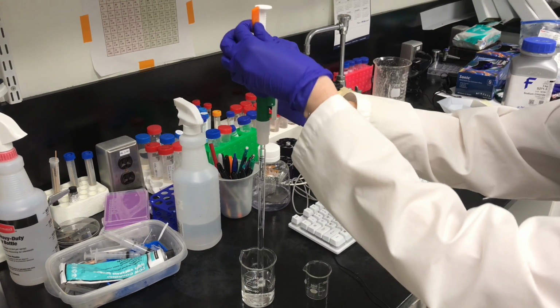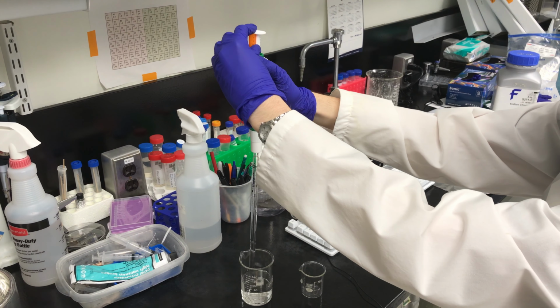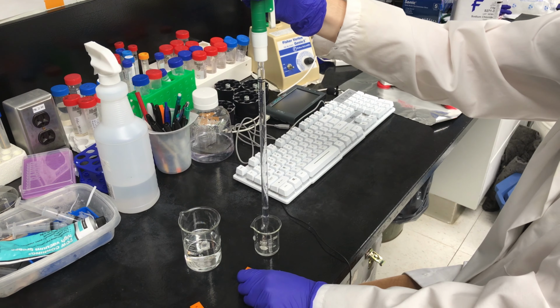In order to have the correct volume of water inside the serological pipette, Caroline takes a small rectangle that has been cut to the correct size. She places it on top of the pipette pump and then pushes down the piece that is poking out of the pump. She pushes that down until the top of that piece hits the other side of the rectangle. Then she removes the rectangle and uses the side lever to dispense the liquid into a different beaker, now that she has exactly 10 milliliters.